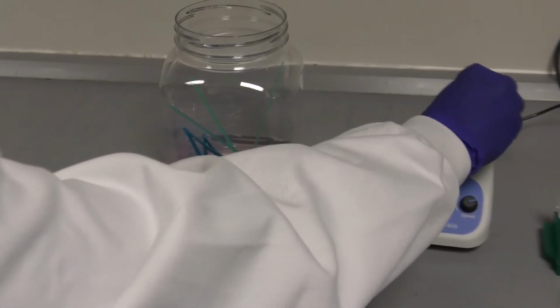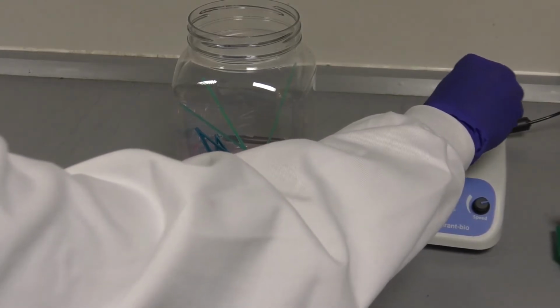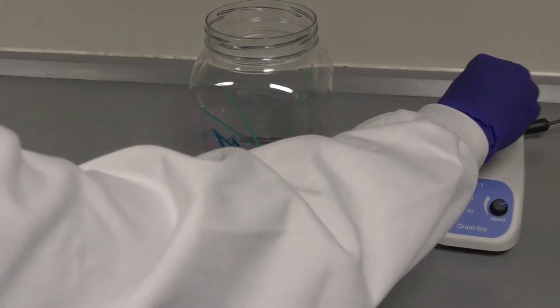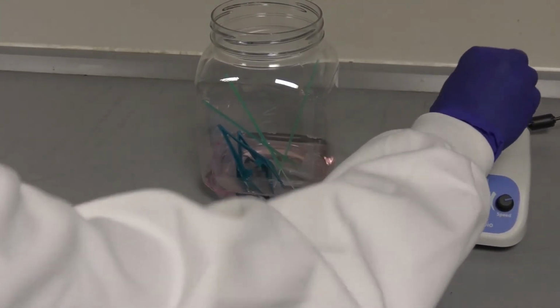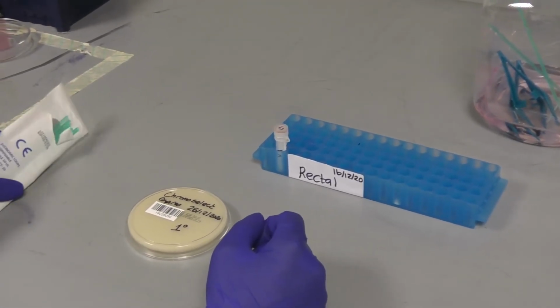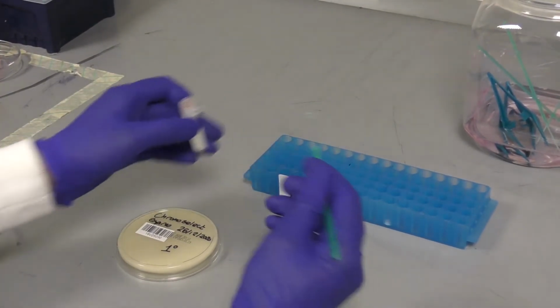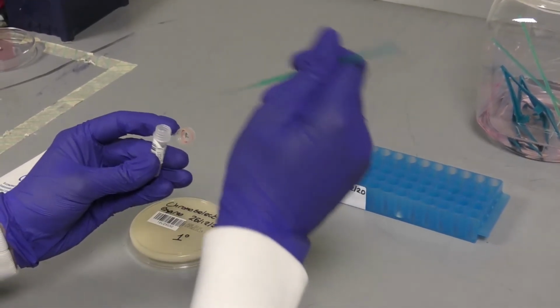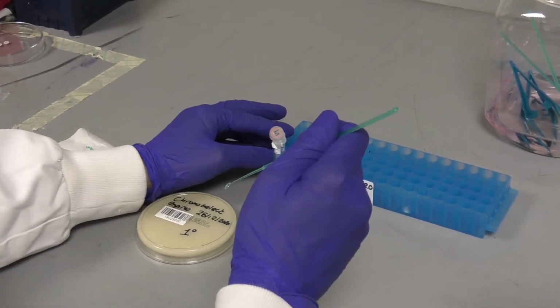Vortex the vial 1 specimen that corresponds to the plate you've just labelled for 15 seconds. This will need to be done for each specimen and its associated plate. Using a 10 microlitre inoculation loop, take 2 full loops from vial 1, your aliquot of Cary-Blair media, and inoculate to create a primary inoculum on the plate.